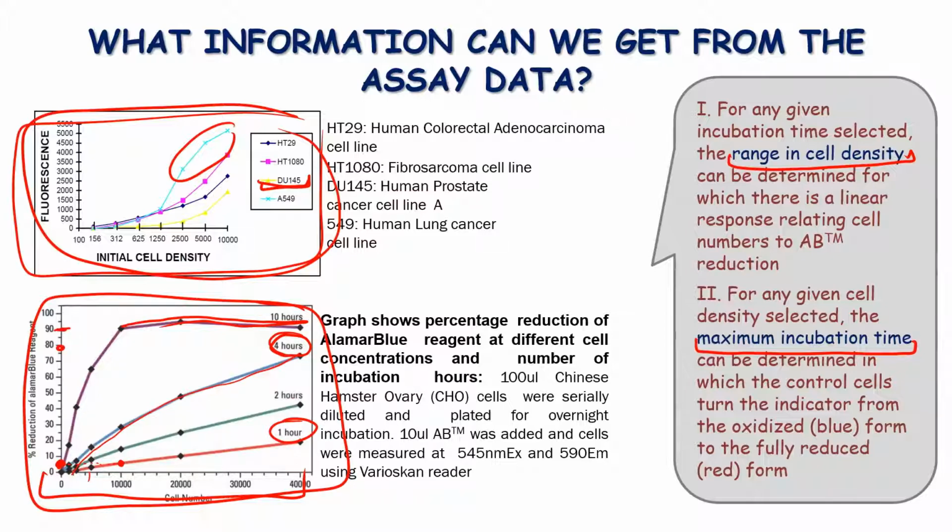experiment. While if you use higher densities of seeding, they reach the plateau very, very fast, and you cannot use it after a particular time of incubation. So I hope you understood what I was saying here.